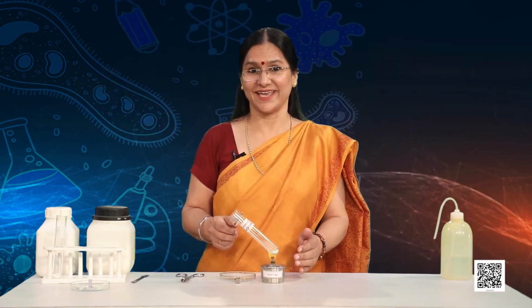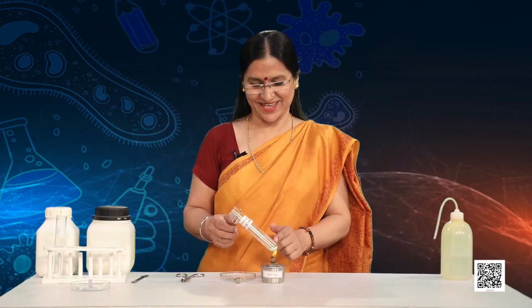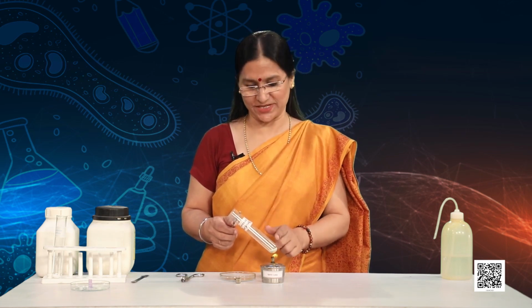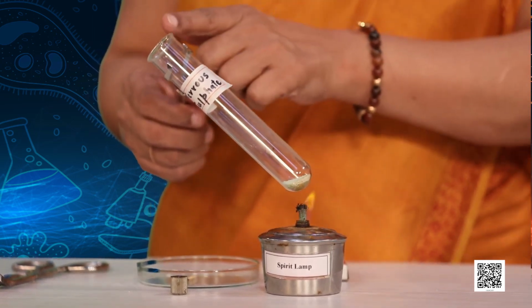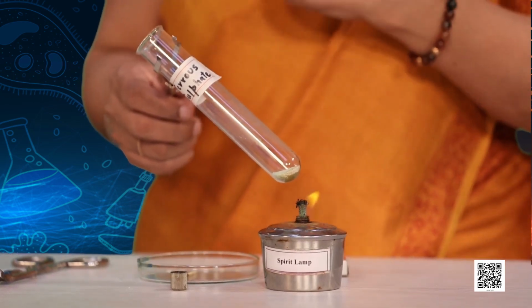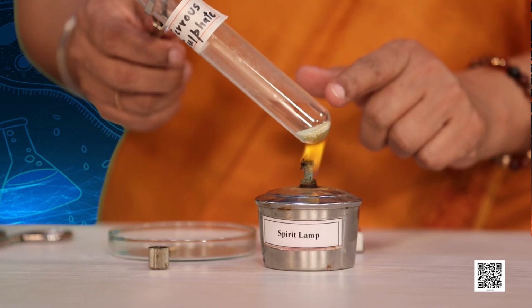Now friends, recharge your observational skills, and while we are heating, observe the change in color of crystals carefully. And always remember, the correct way of heating the boiling tube is to tilt it at an angle of 45 degrees. And also, never point the mouth of the boiling tube at your neighbors or your own self. Can you see the color change happening in the color of the ferrous sulfate crystals?